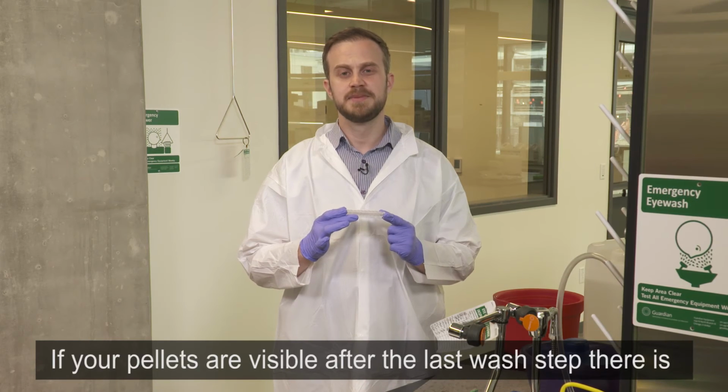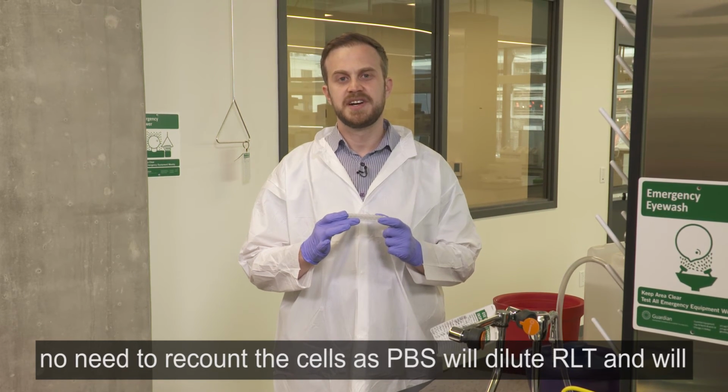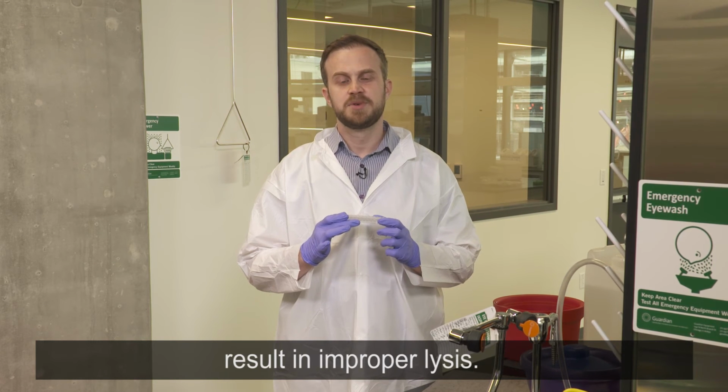If your pellets are visible after the last wash step, there is no need to recount the cells, as PBS will dilute RLT and will result in improper lysis.